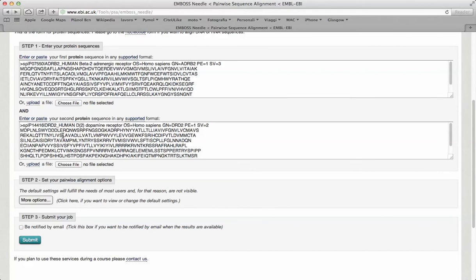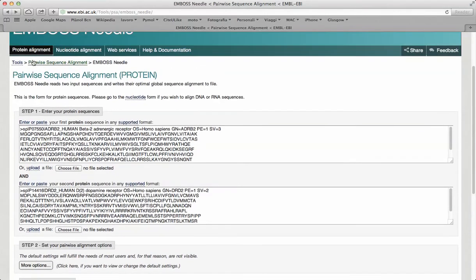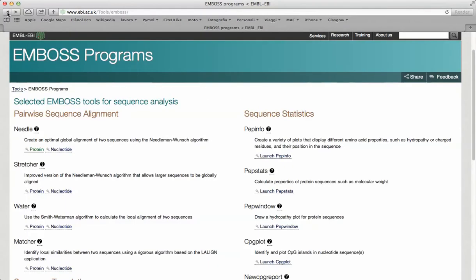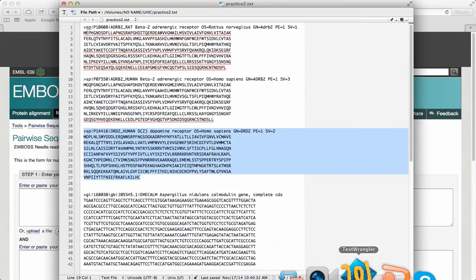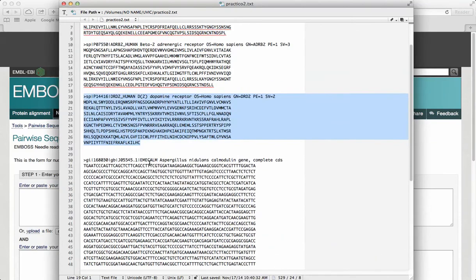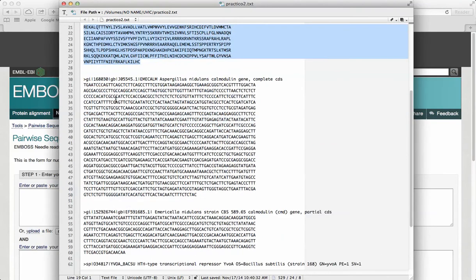Now, let's go to compare two nucleotide sequences. Let's go to compare two nucleotide sequences.